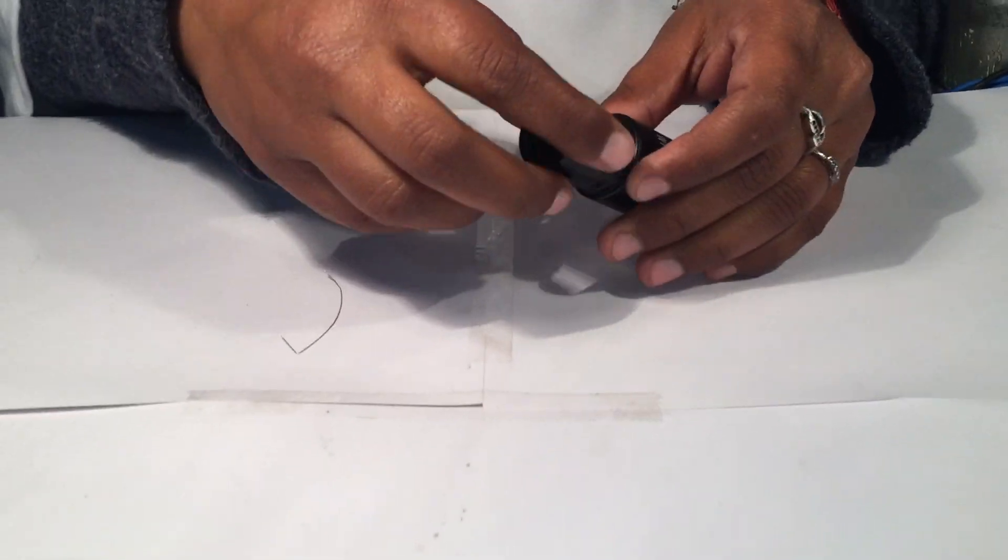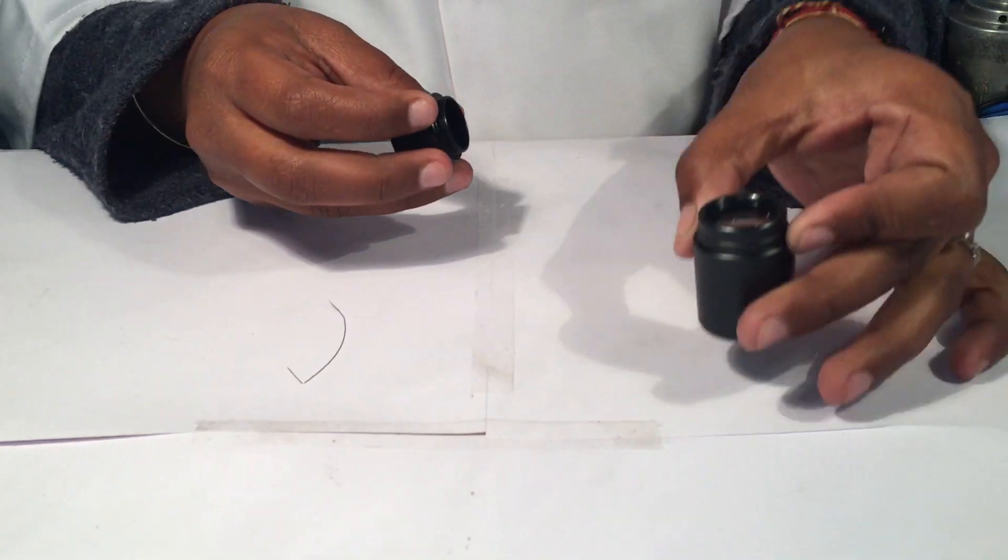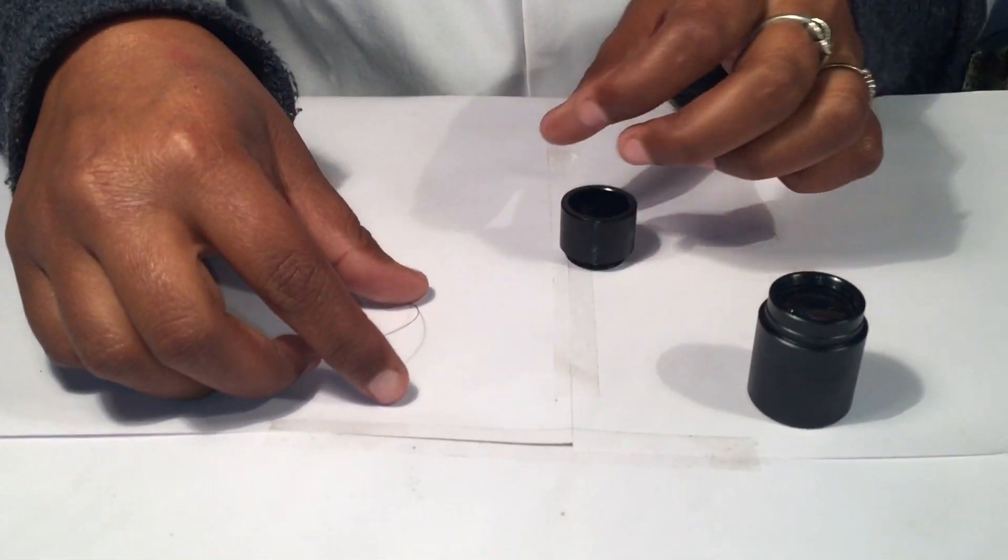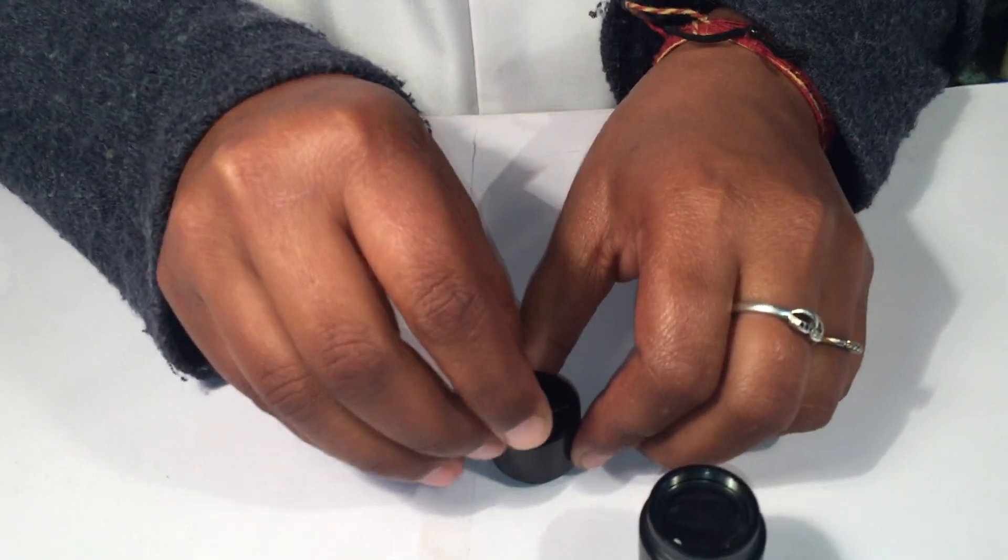We will unscrew the lower part of the eyepiece, take the pointer, and place it in the groove.